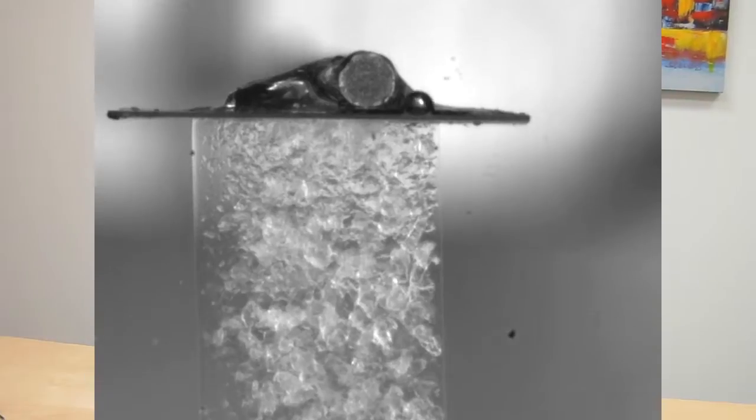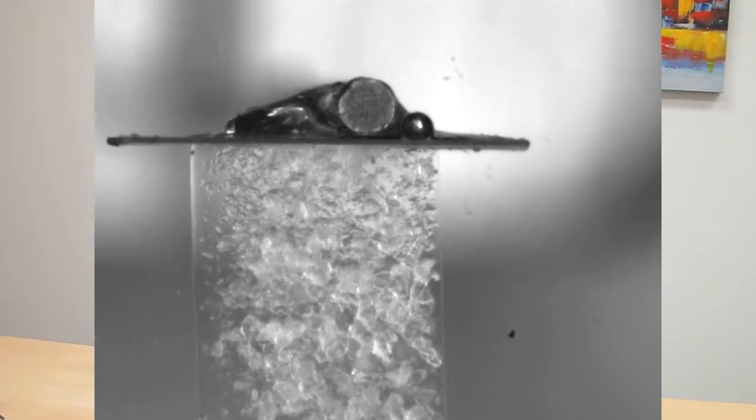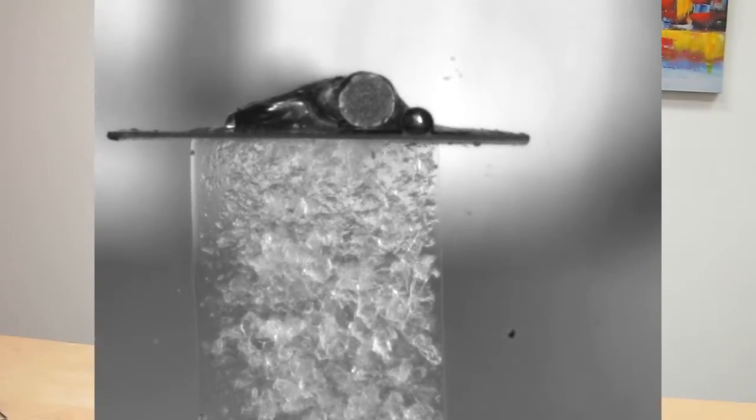I cut that to 4.7mm long and was able to do a parallel plate compression test on those small cylinders. I had a fixed lower plate and came in with a force sensing upper plate and did a compression on that cylinder, measuring force and displacement. From that I was able to get stress and strain by dividing the force by the cross sectional area of the cylinder.